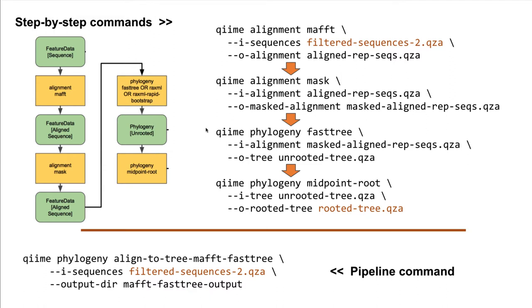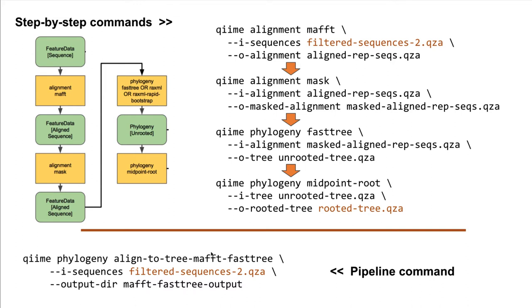One advantage of running commands independently, for example, this QIIME phylogeny step, some phylogeny tools provide an awful lot of options to use. By running them manually, you have access to a lot more options than you would if you were to run it in a pipeline. This is intentional, as the pipeline is meant to run very common tasks in a very easy to use and accessible way.